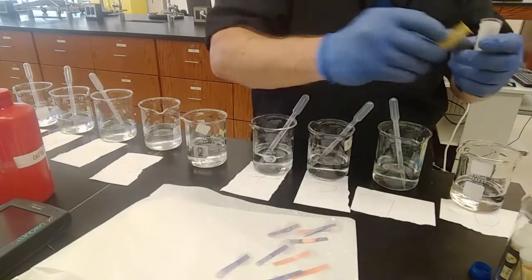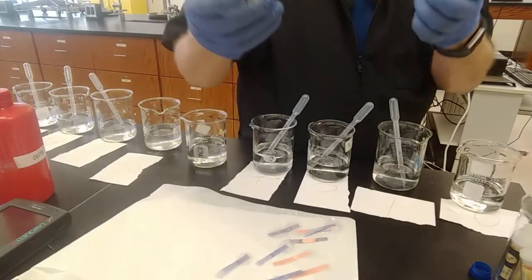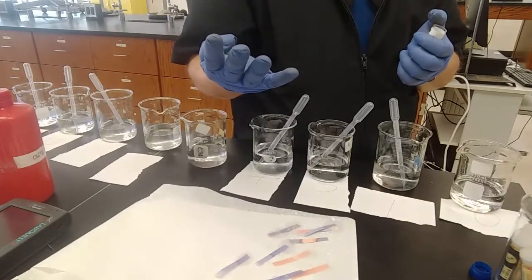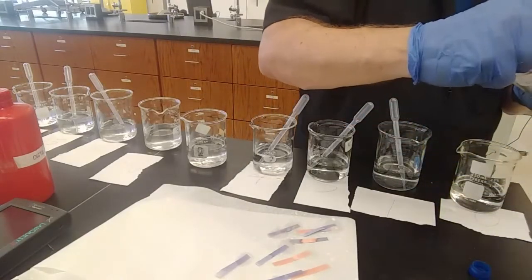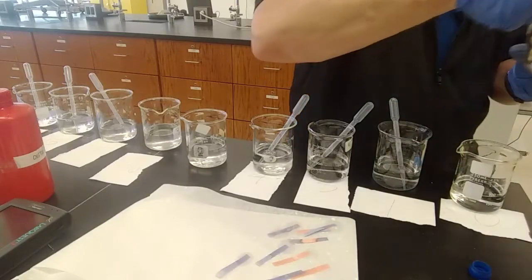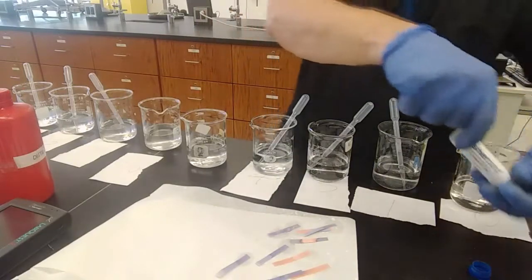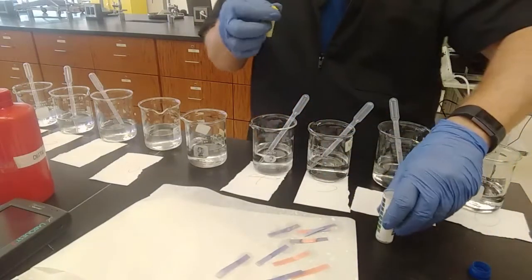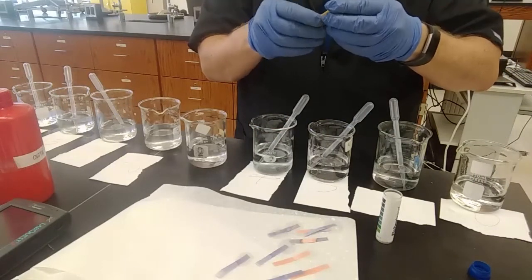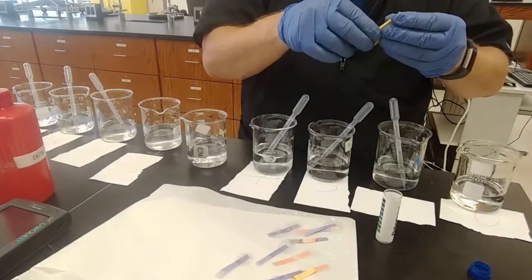These are kind of dipped in wax, so you have to kind of peel one off. Some of them, the universal indicators, have 4 color strips on there, and you can measure that. You have to look at all 4 colors, which gives you a little bit more of a precise reading. So here we go. We'll rip off a strip each time and match it to the bottle to see what we see. Rip off a whole strip so it's easy to hang on to.